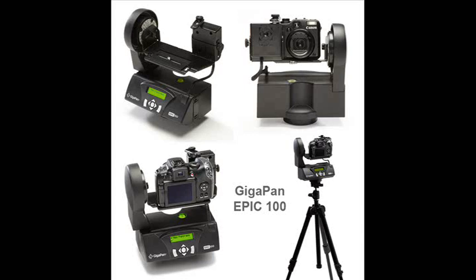The unit swivels and rotates around a central point, taking pictures at specific intervals using a robotic finger that presses the shutter button on the camera. Digital wire signaling is also available for certain cameras. Once complete, the individual images are stitched using GigaPan software to form one large panorama that is zoomable to the resolution of each photo.